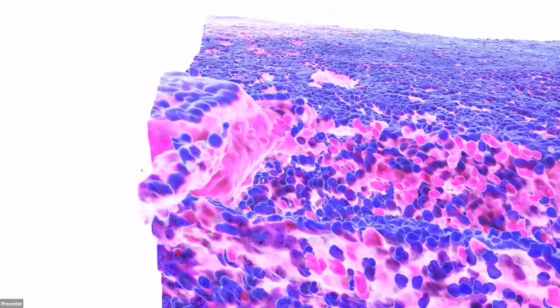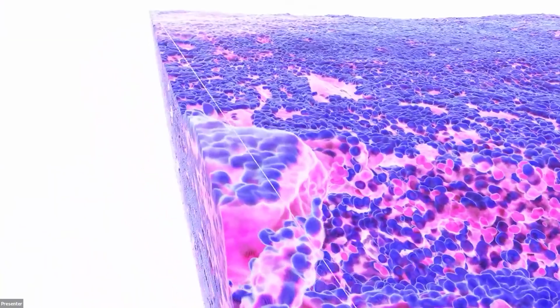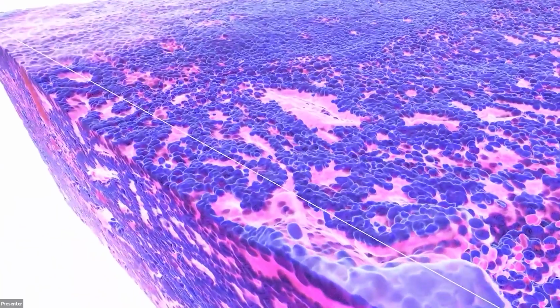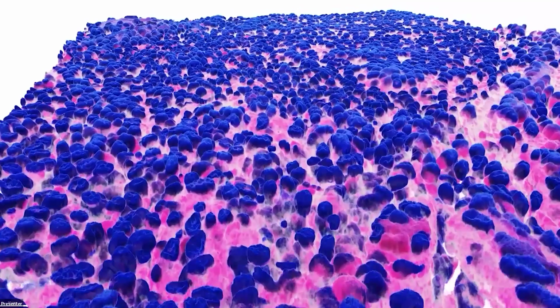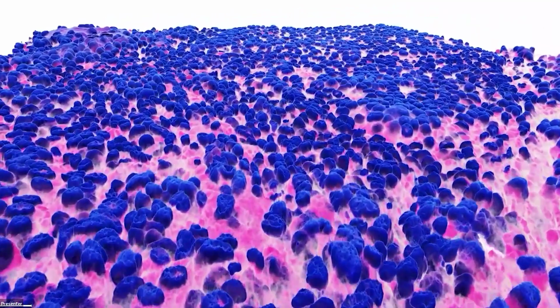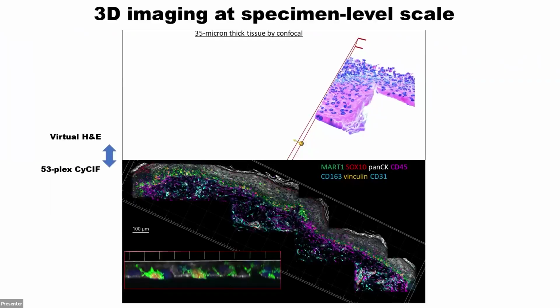Why am I bringing this up? Because 3D optical and serial reconstruction are the only way to get this kind of clinical purple and pink image from a 1 millimeter thick dataset. And to my knowledge, you cannot get this using traditional bright field unless with some sophisticated instrumentation.